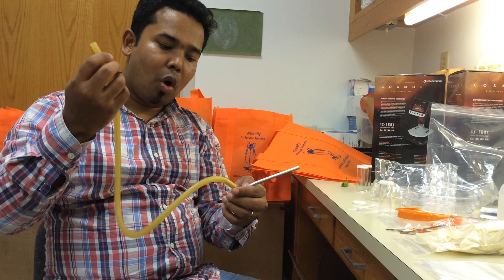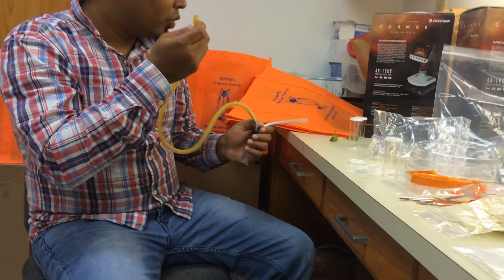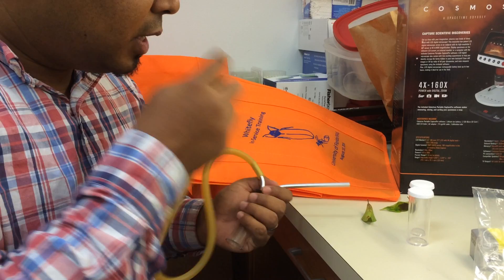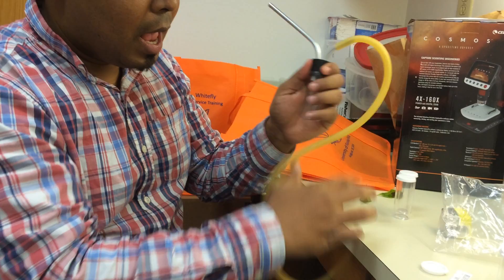You use the hose to intake air through your mouth, and this section — the collecting tube — collects the sample. For example, you will take this part in your mouth, inhale the air, and you will see the collecting tube suck the sample inside the vial.